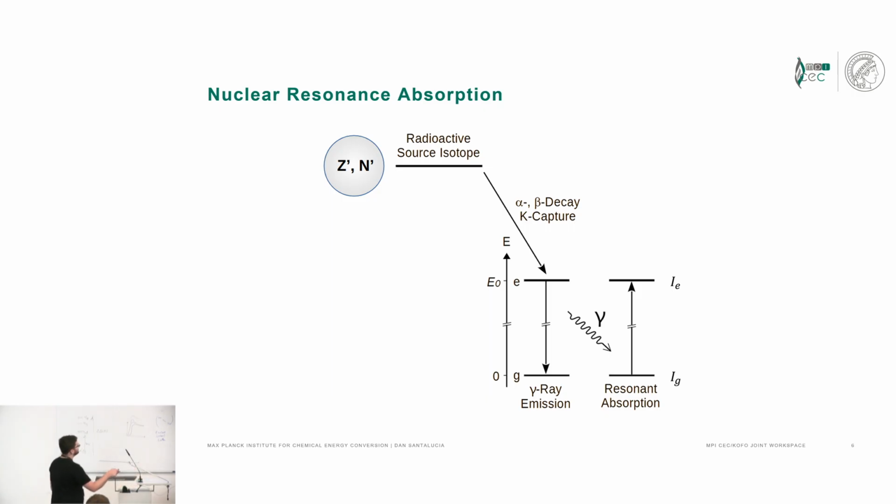And it can decay to some excited nuclear state of interest. And that excited nuclear state can emit a gamma ray because it's a nuclear transition. It decays to a nuclear ground state, right? And then you have some sample which can absorb that radiation, and you can then detect based on some transmittance experiment, for example, what has been absorbed, what has not been absorbed, okay?